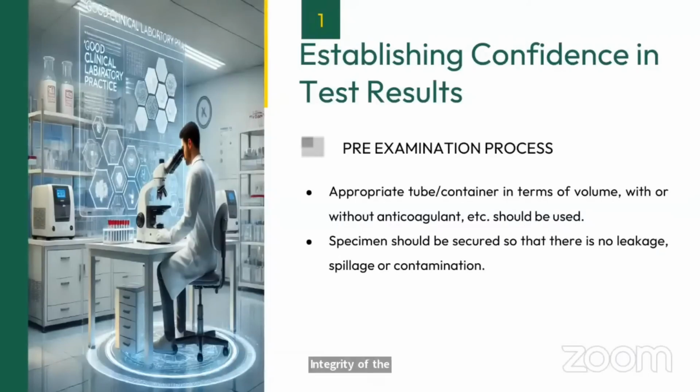So if you are carrying a specimen from one location to another, you should prevent leakages, because many times some specimens are infectious, so it should not cause any public health hazard. Also, if there is any leakage, it can cause contamination of your specimen. So the specimens must be secured appropriately to avoid any type of leakages, spillages, and contaminations.